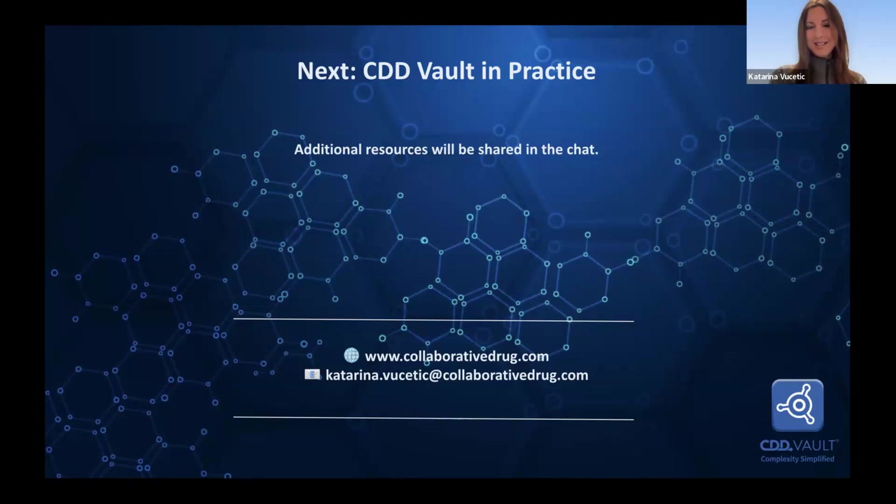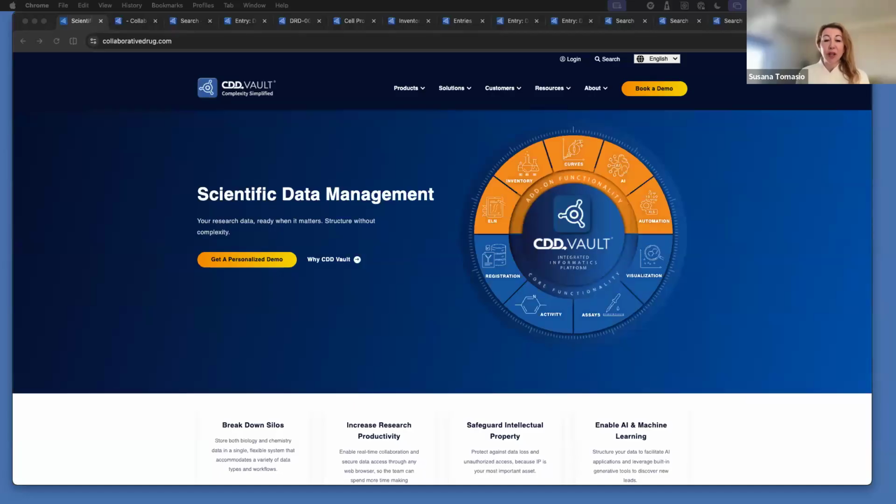Thank you, Katarina. Hi, everyone. Thank you. So let me start sharing my screen. My name is Susana Tomasio. I'm a senior application scientist at Collaborative Drug Discovery. I'm basically part of the technical team and I provide technical support to the CDD Vault users.